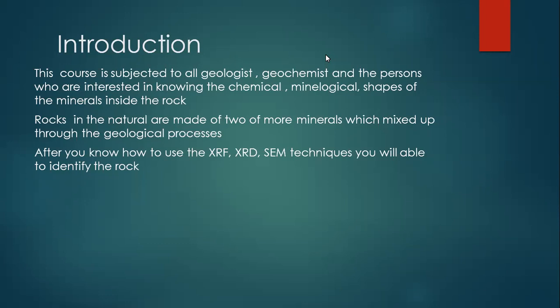After you have learned how to use the XRF, the XRD, and the scanning electron microscope techniques, you will have the ability to identify the rock type you're dealing with. So this was a small introduction about this course.